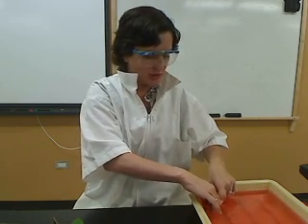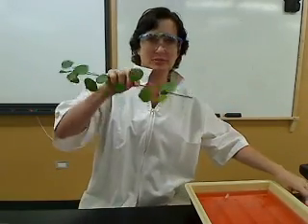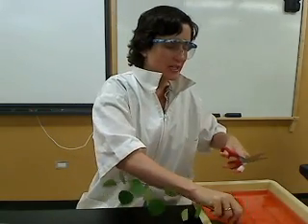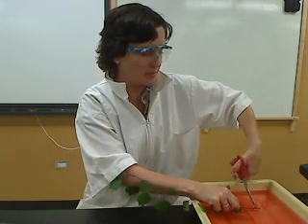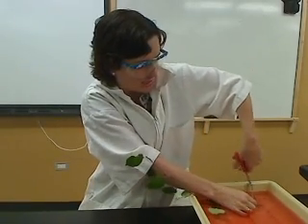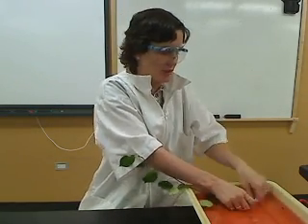You might need a couple of people to do this, so one person is going to hold that underwater. The next step is to prepare the plant to be inserted into the tubing. You want to cut a fresh tip underneath the water — notice how that's under the water as I snip the edge of the plant. The reason for this is that we don't want any air bubbles to go into the xylem and slow down the transpiration flow.